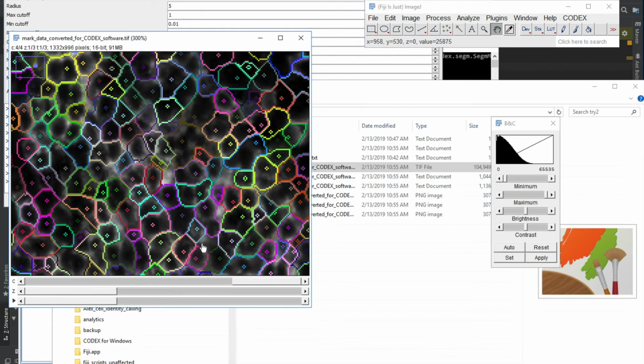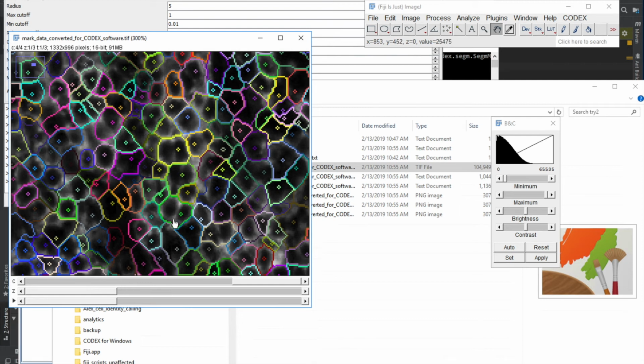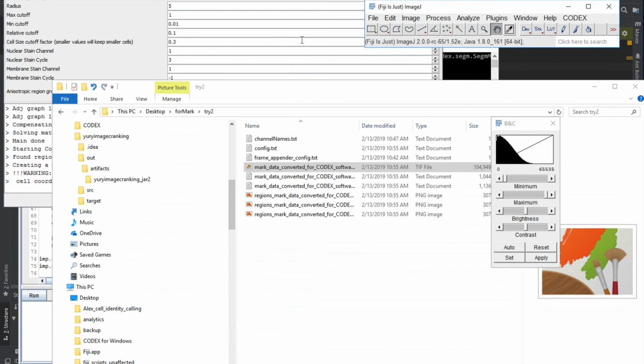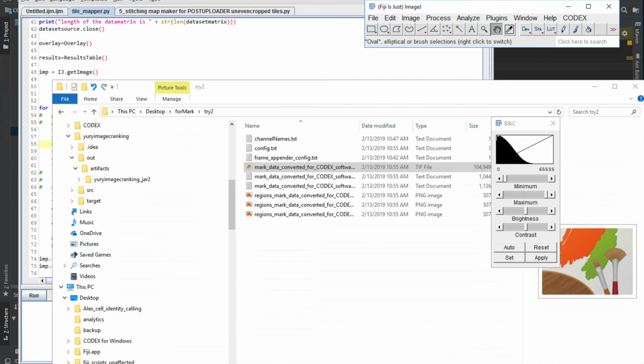Let's do try3, where you definitely have some objects. It did a pretty good job here, and it does retain some of the objects under-segmented. Again and again, if you require a 3-dimensional stack rather than a single plane, this would really be resolved, because your CD45 or whatever, CD20 signal looks a little bit fuzzy. But just for the sake of curiosity, let's do try3.